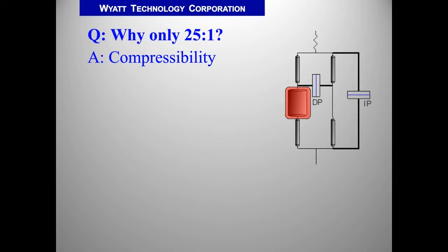So when you get a pump pulse, the pressure on the left side that has the holdup reservoir is changed by the fact that the fluid goes into the holdup reservoir, but it gets compressed a little bit. So it's almost as if this is like a little spring where the holdup reservoir volume changes ever so slightly when the pressure changes. And that's not properly balanced on the other side of the bridge, and that's what limits the performance of this bridge.